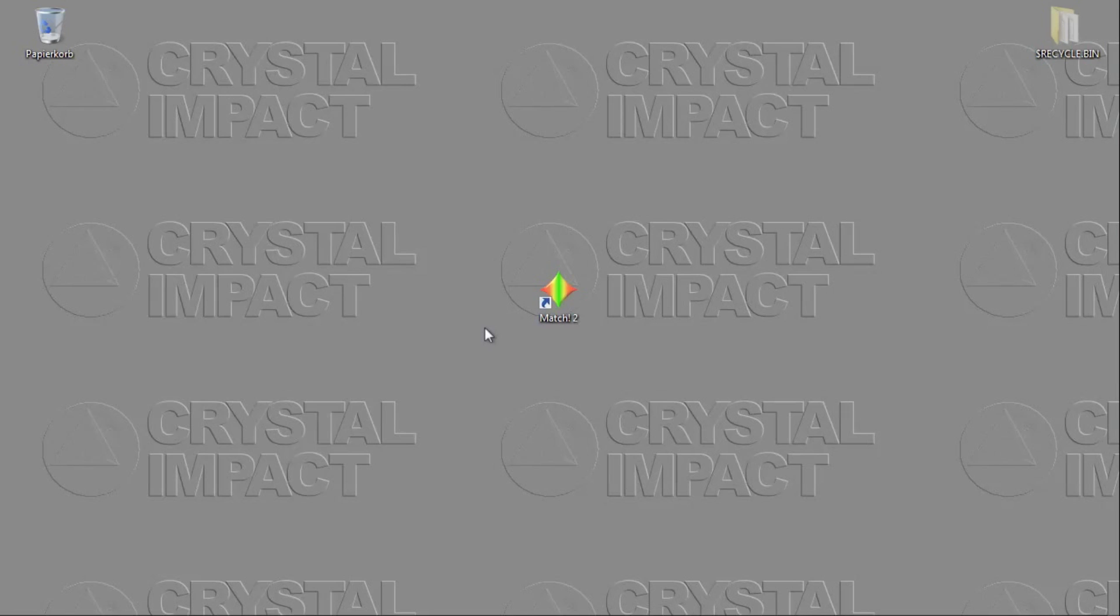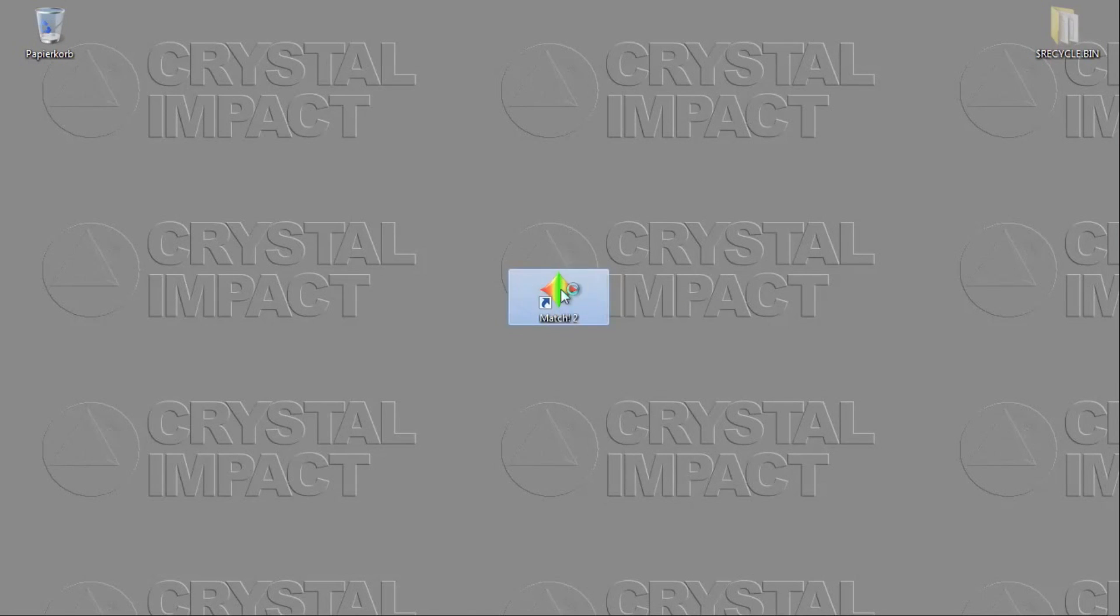On my computer I have just installed both the Match software as well as FullProf in order to be able to run Rietveld refinement calculations later on. So let's start right away. Let's first start the Match software.